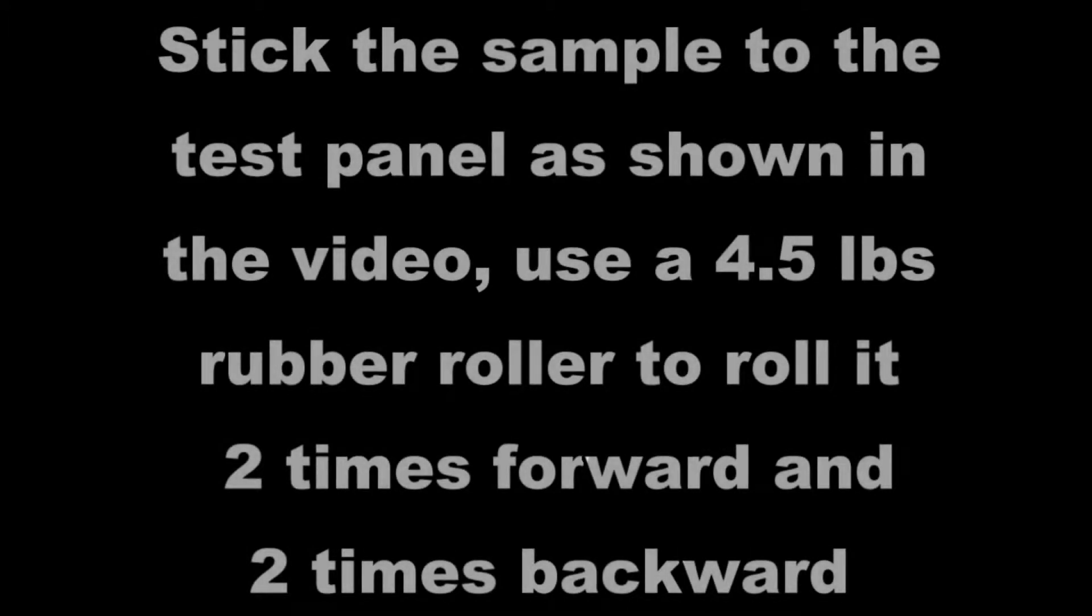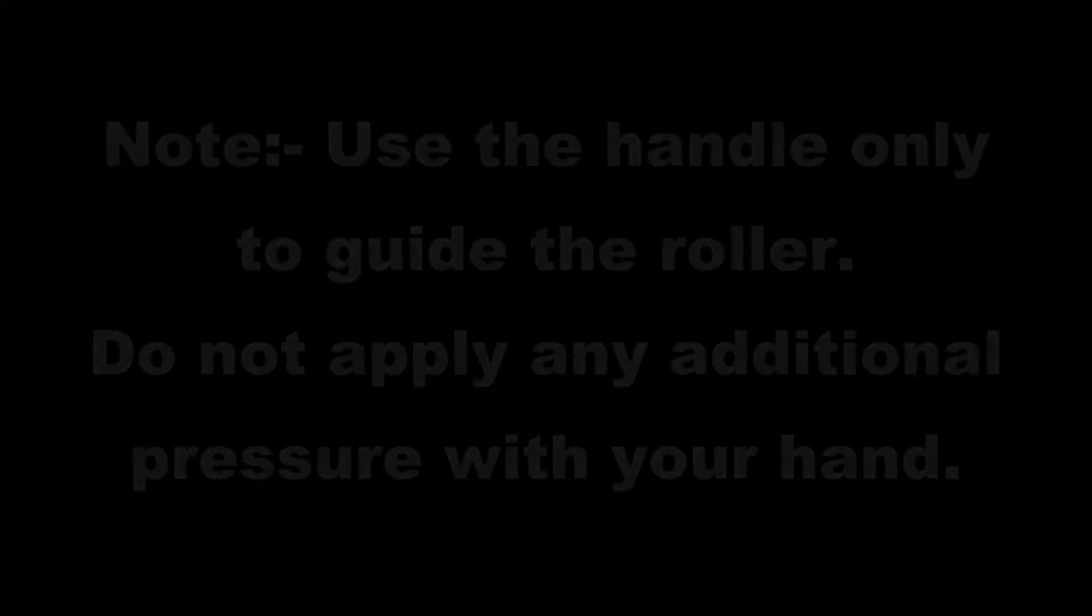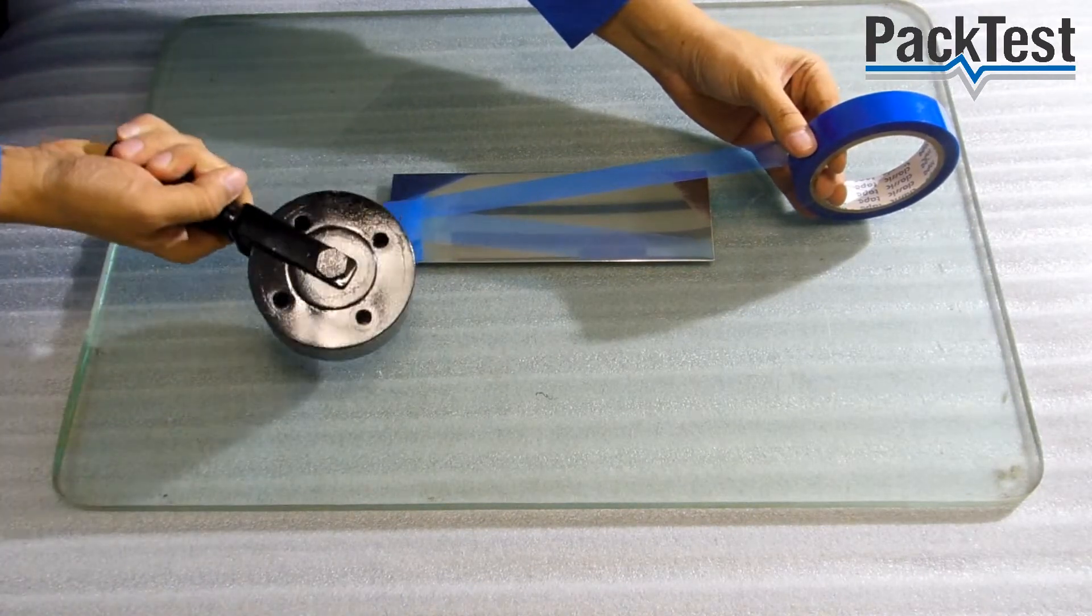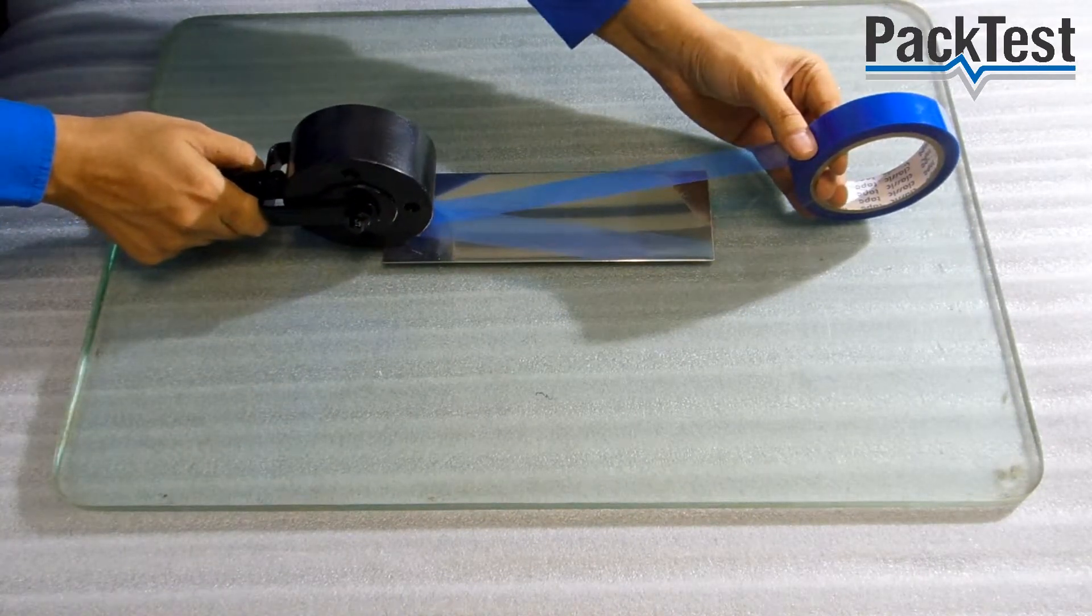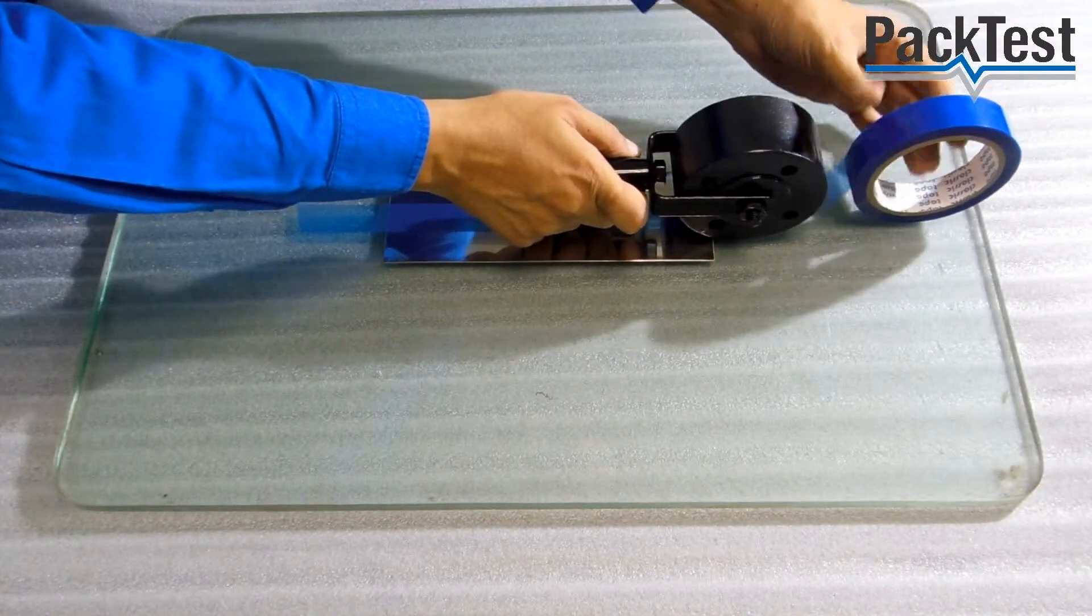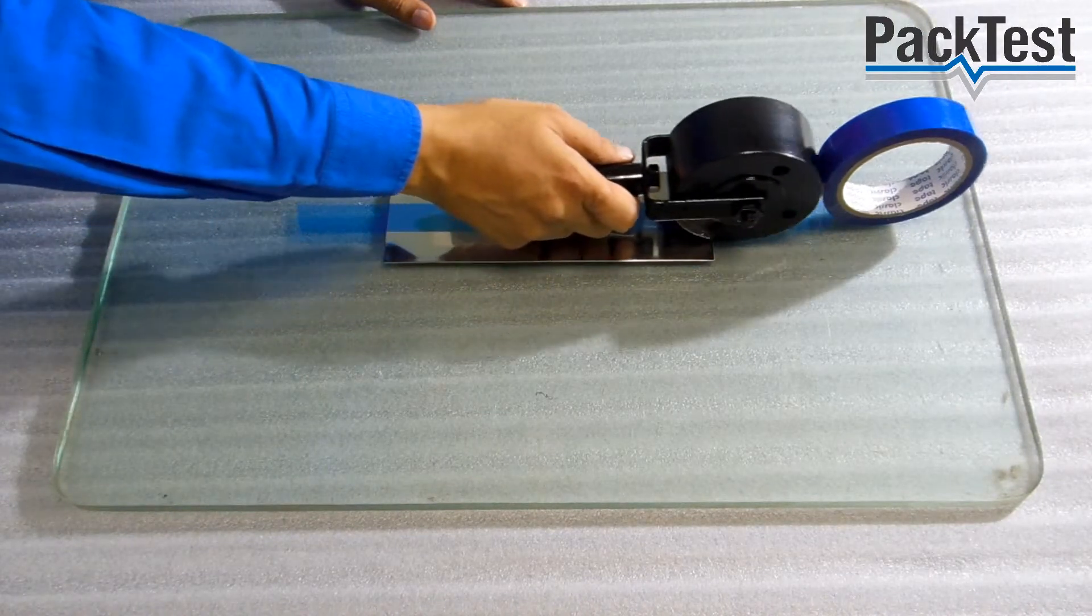Clean the test panel thoroughly with suitable solvent and let it dry completely. Stick the sample to the test panel as shown in the video. Use a 4.5 pounds rubber roller to roll it 2 times forward and 2 times backward. Note, use the handle only to guide the roller. Do not apply any additional pressure with your hand. Repeat the rolling action 4 times.